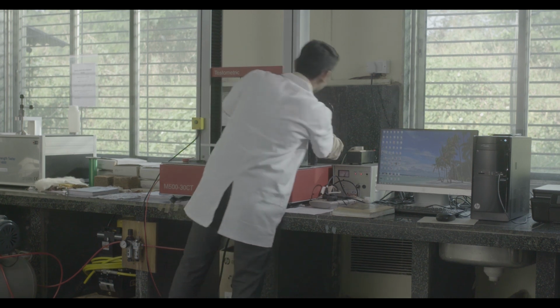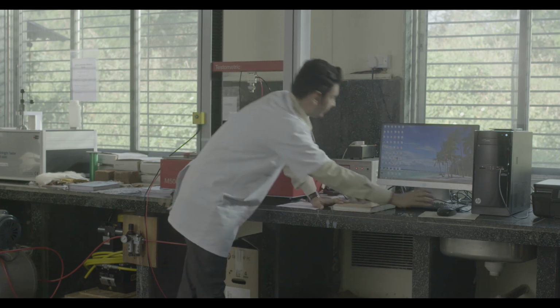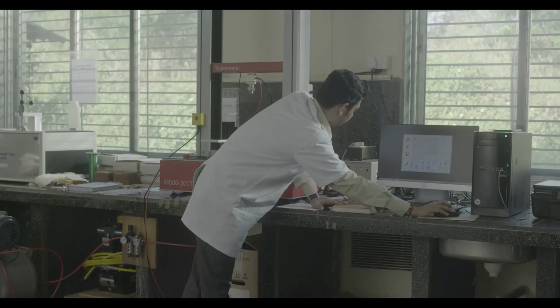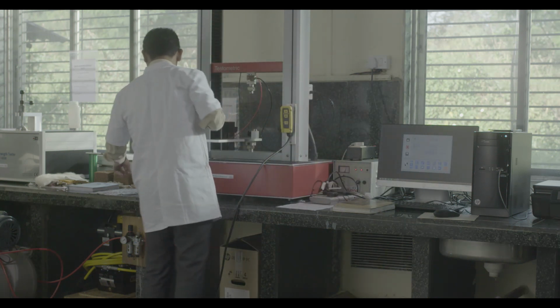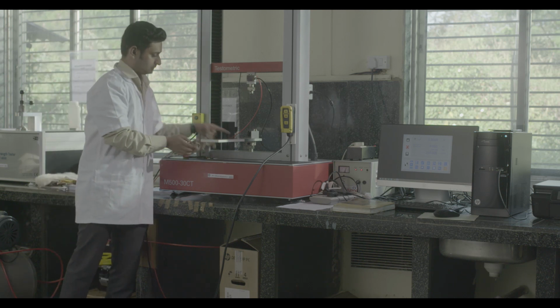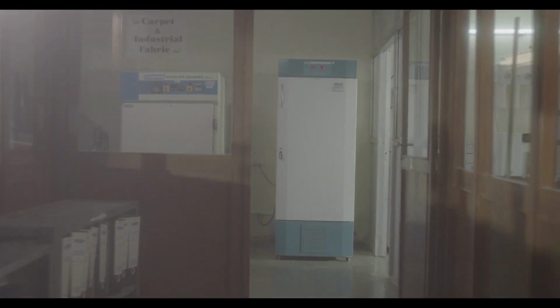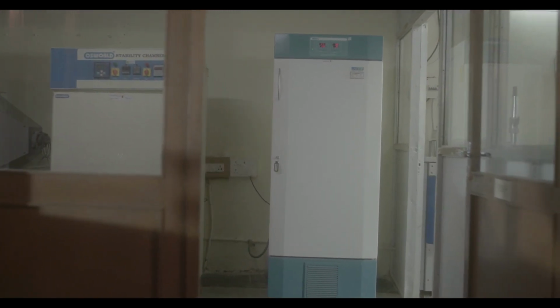Switch on the instrument and the computer. Open the software. The specimen should be cut a bit larger than the slide size to attach it properly. Cut at least 5 warp-way and 5 weft-way test specimens for woven fabric. Condition all specimens in the standard atmosphere of 27 ± 2 degrees centigrade and 65 ± 2% RH.